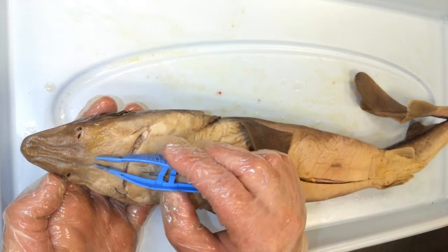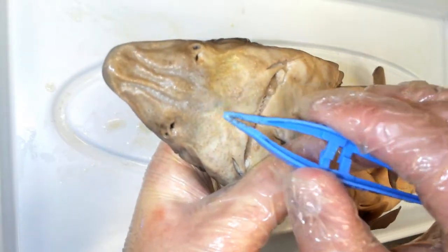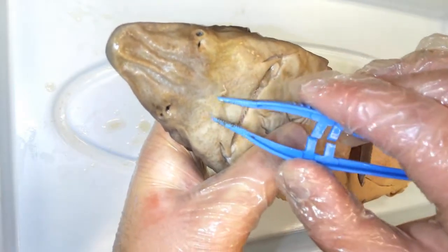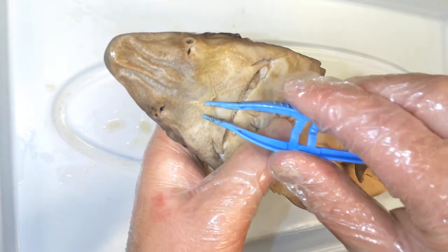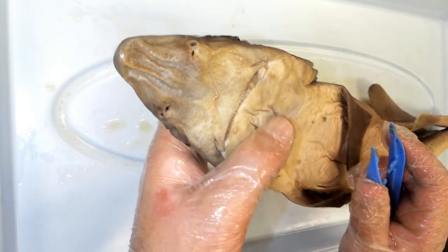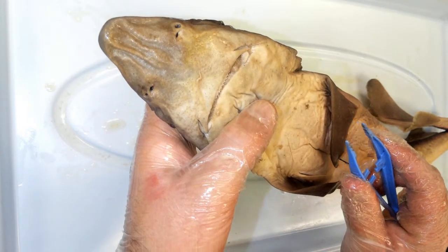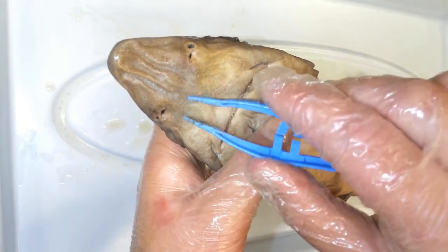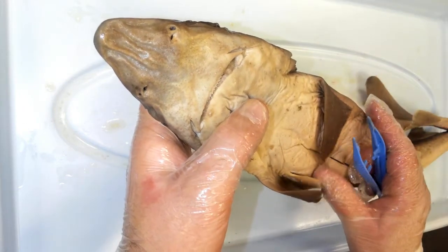Also on the ventral side of the rostrum are all these pores. If you look closely you can see them — they are part of its sensory organ called the ampullae of Lorenzini. These are gel-filled pores with nerve cells deep within them that pick up electrical currents from the water. All living things release a very weak electrical field, and the ampullae of Lorenzini can pick up those electrical fields, making sharks very good at sensing organisms around them.